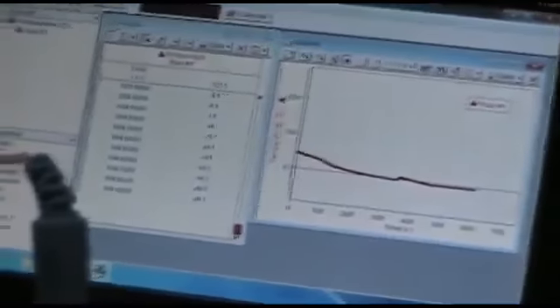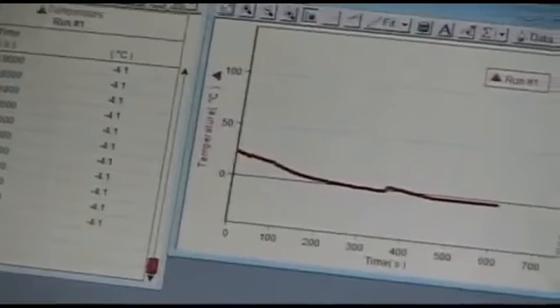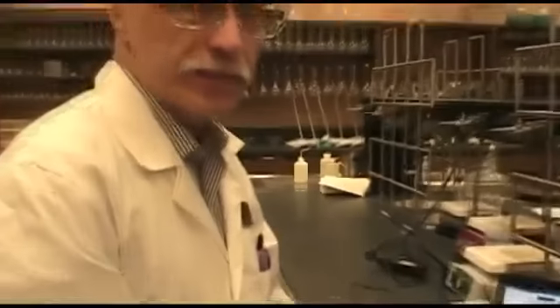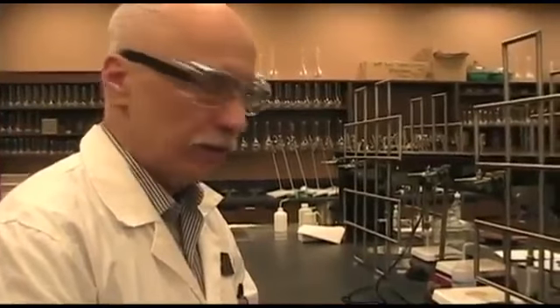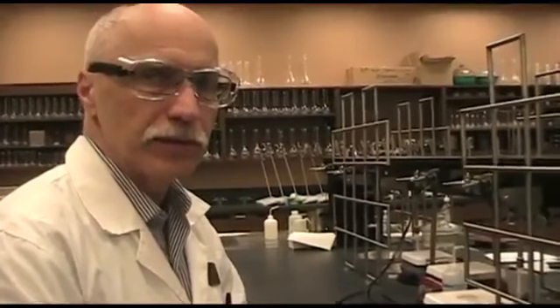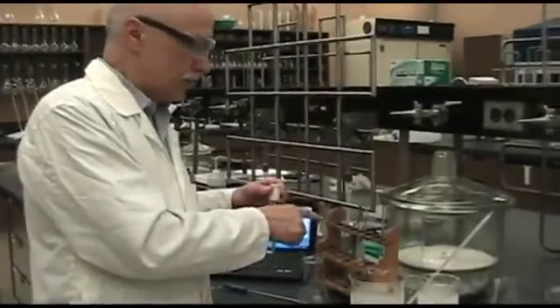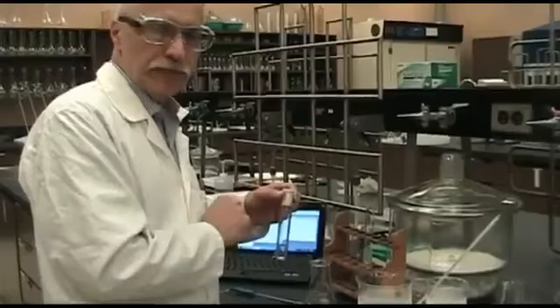So there's our slush, and that would be our sodium chloride. So you would record a delta TF of 3.9 or so, because the water freezes at zero, so obviously we've reduced it by 4 degrees. So next we can do the calcium chloride and see if there's any difference in terms of the freezing point depression, the delta TF. So we notice that sodium chloride solution freezes at about -4.